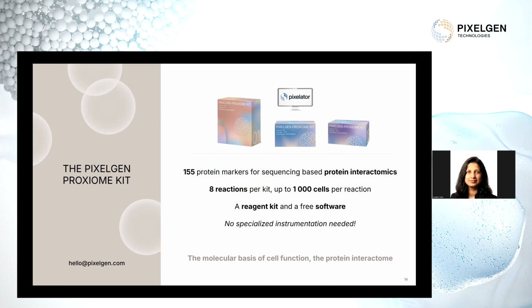That's great to know. Another question that I had was how easy it was to do these co-culture experiments and later on perform a proximity network assay on it. In these particular experiments, we used an effector to target ratio of 1 to 1, so we had 1 CAR T cell to 1 tumor cell. We had quite efficient killing. Since we had so many CAR T cells, we did not purify them before the analysis. We just took all the cells and ran the proximity network assay.